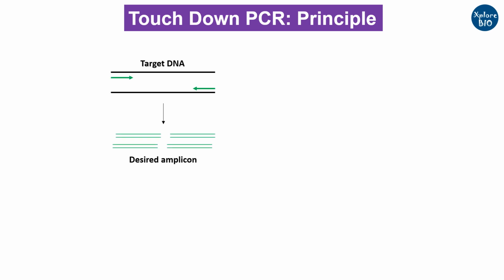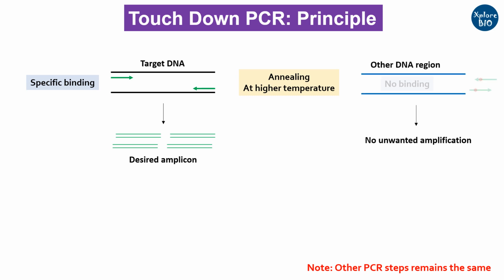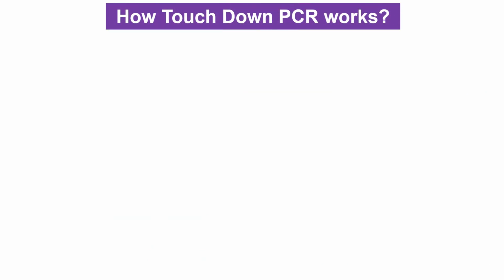Coming on to the basic principle behind touchdown PCR. In touchdown PCR, you play around with the annealing temperature in such a way that you get specific amplification by keeping the annealing temperature much higher in the initial cycles and let only the specific and highly complementary region of the DNA to bind with the primer. In subsequent PCR cycles, annealing temperature is gradually reduced to further increase the chances of amplification while maintaining the specificity of the product amplified. Now let's quickly see how touchdown PCR actually works.